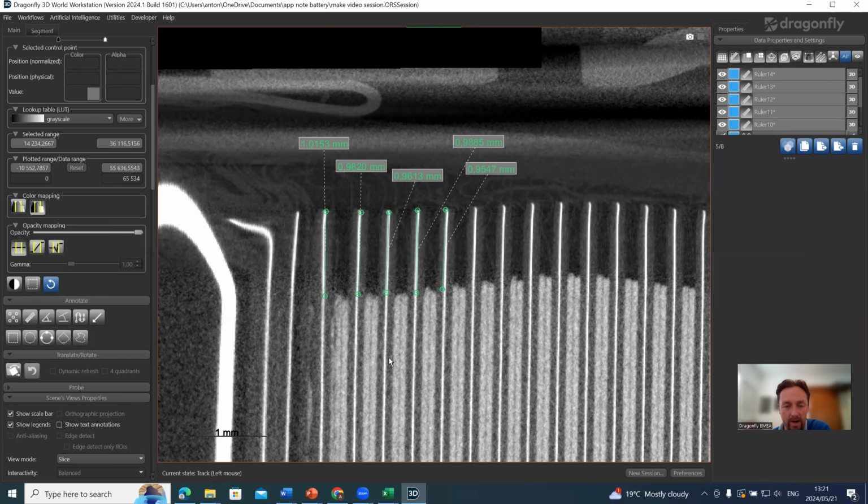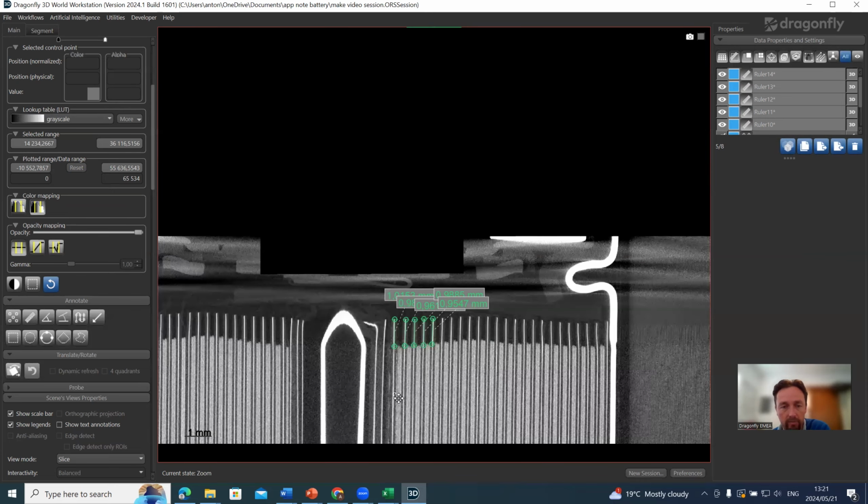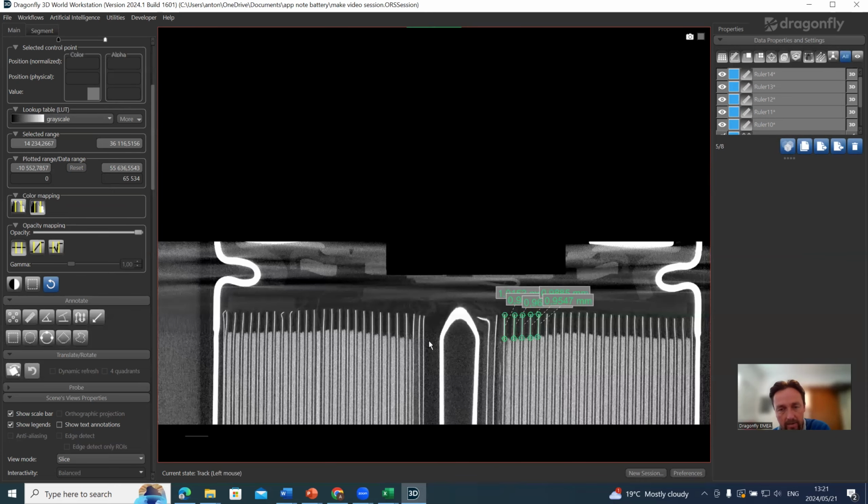Of course, making manual measurements might be quite slow if you have to do all of those overhangs in a full cross section and maybe make 2 cross sections per cell. With a number of cells per day being scanned, maybe 10 minutes per scan, this is going to take you more than 10 minutes to do.